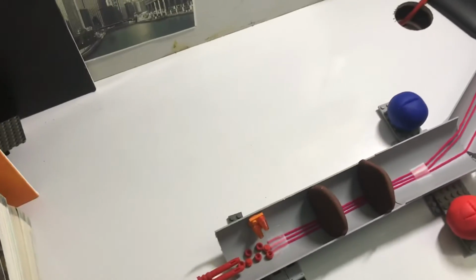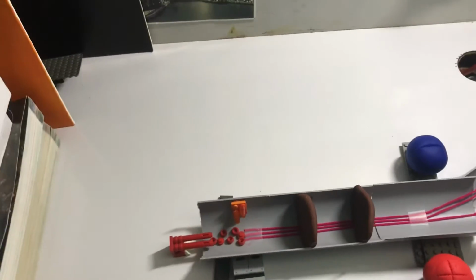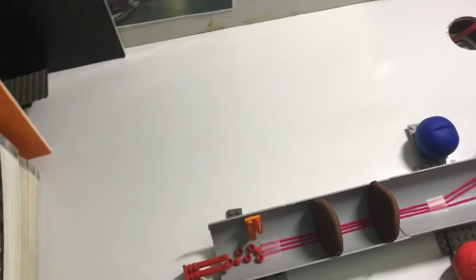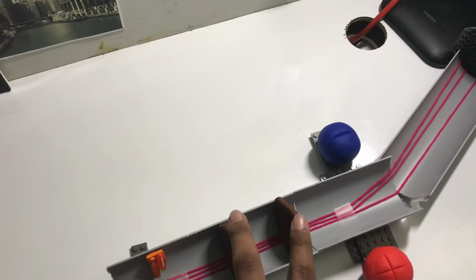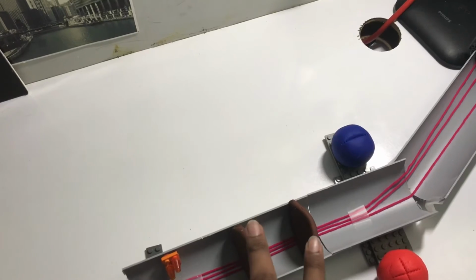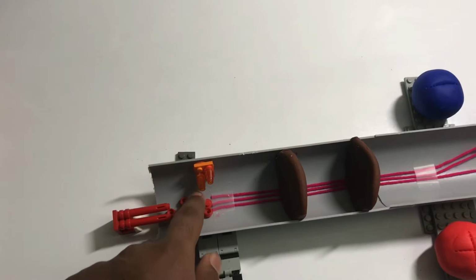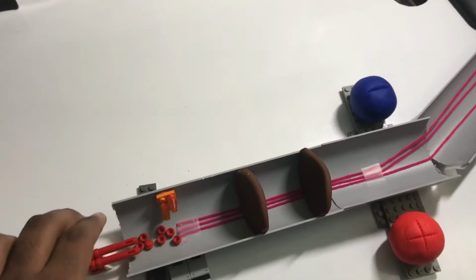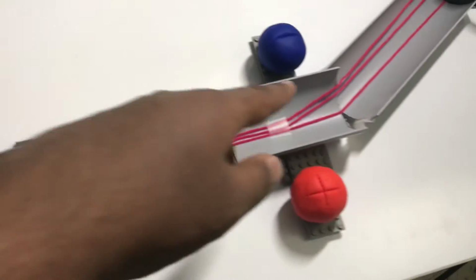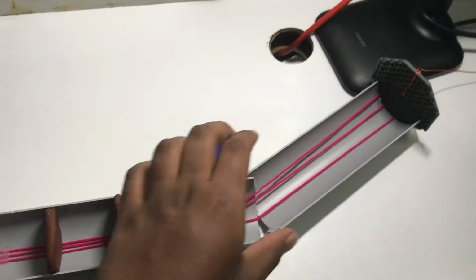And segueing into the third step, which is acceleration. These two plates here, represented by Play-Doh, are negatively charged, and the laws of attraction tell us that opposites attract, right? So the positive ions and negatively charged plates are attracted to each other. So these positive ions will want to move towards them, and they will increase or accelerate and go through them into the second part of the mass spectrometer.